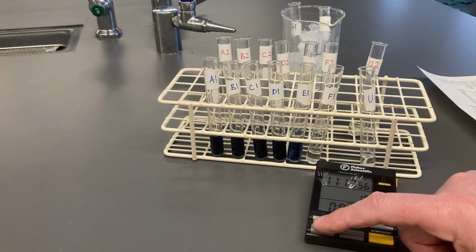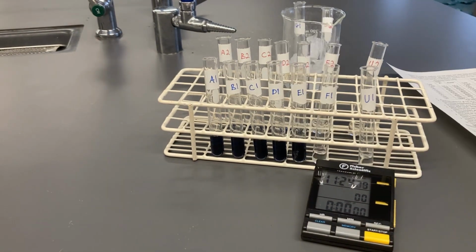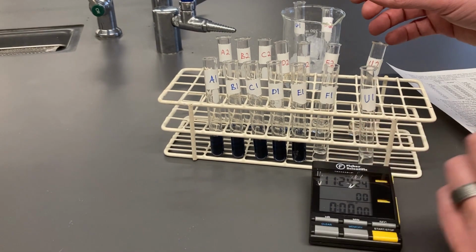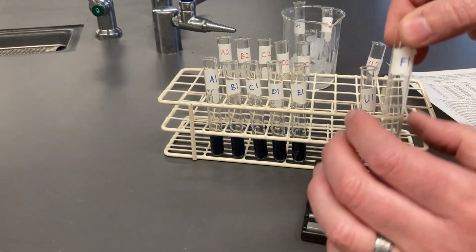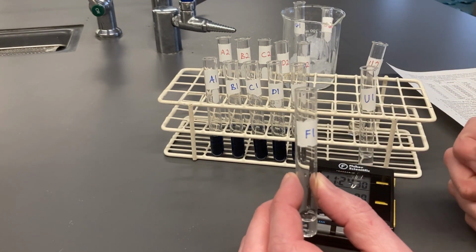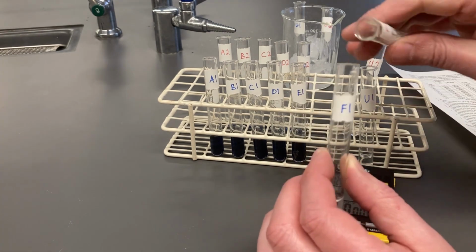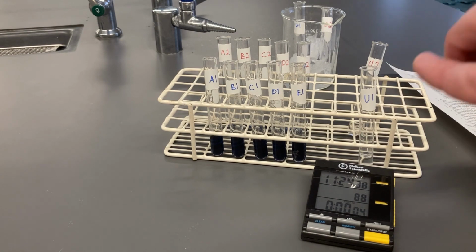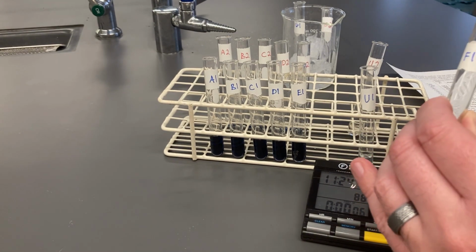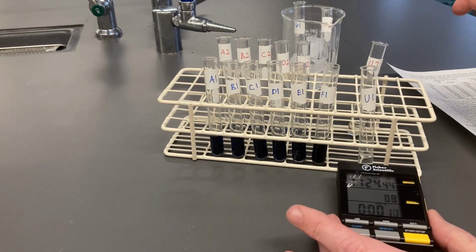And now we'll do the F2 and F1. All right, now I'm going to mix the F1 and F2. And these are higher concentrations, so I'm going to mix them quickly here. Oh, there it went.